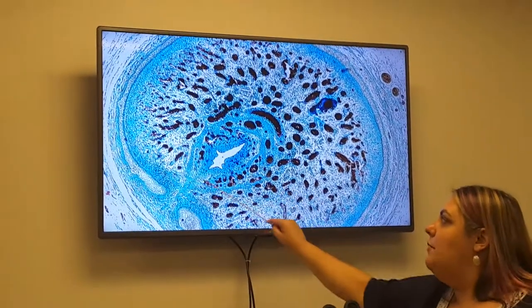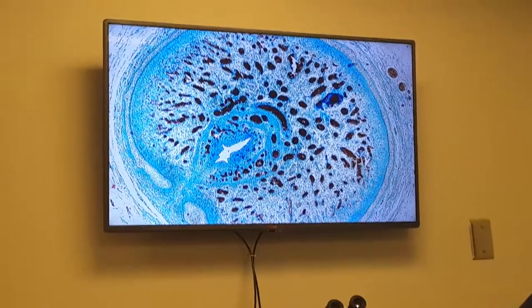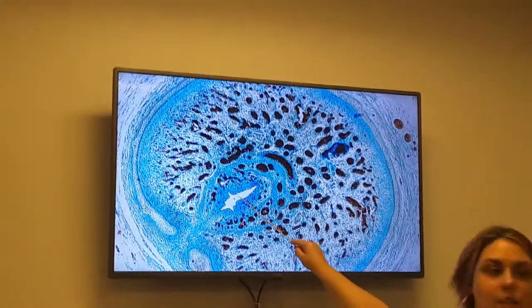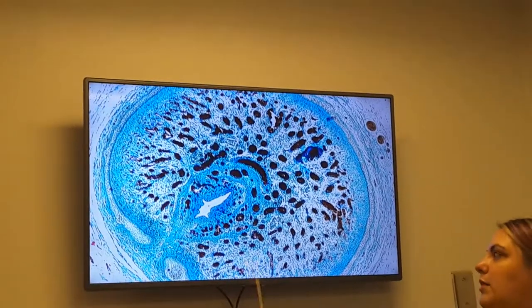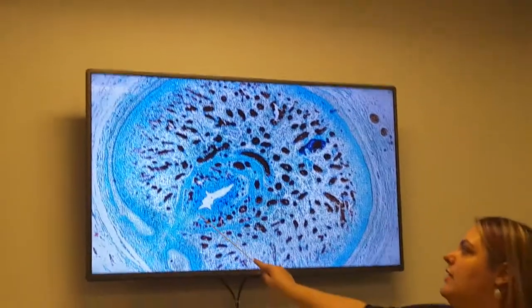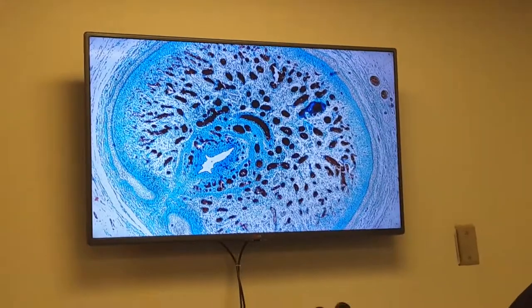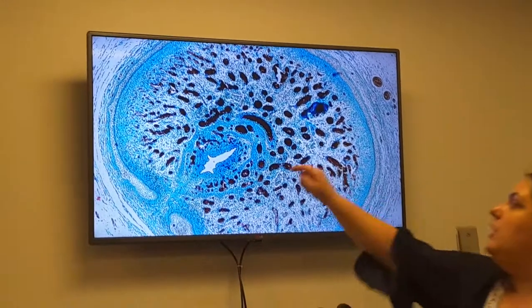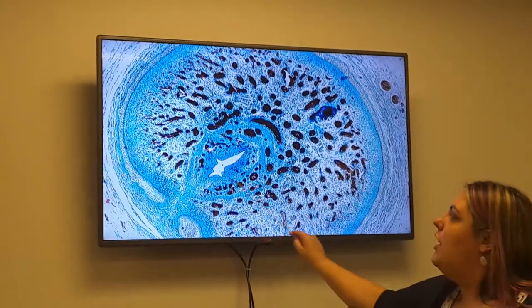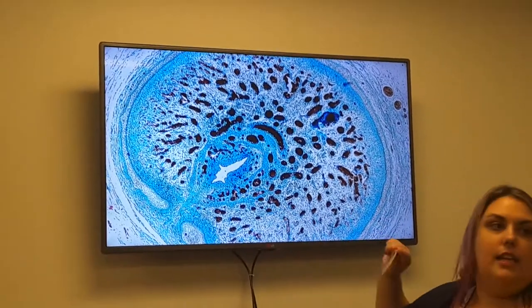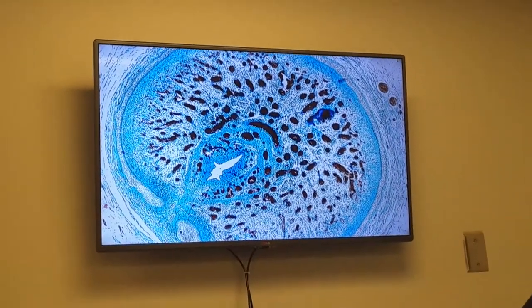What's this mass of spongy tissue called? Corpus spongiosum. So this is the urethra — this is probably the penile urethra. The other mass of spongy tissue that contains just the urethra is the corpus spongiosum. So these are corpora cavernosa out here; this is the corpus spongiosum with the urethra inside. These are arteries, peripheral veins, stuff out along the edge.